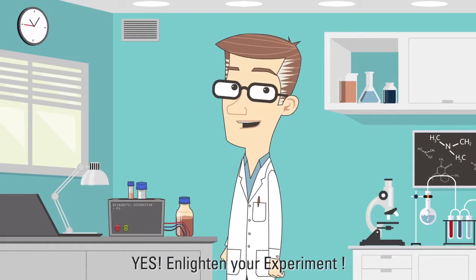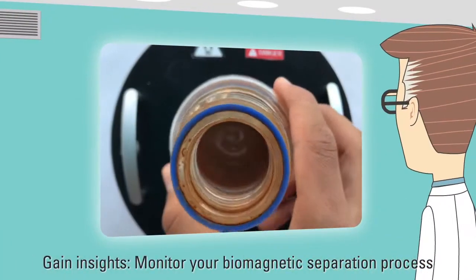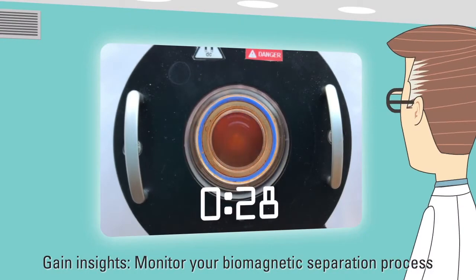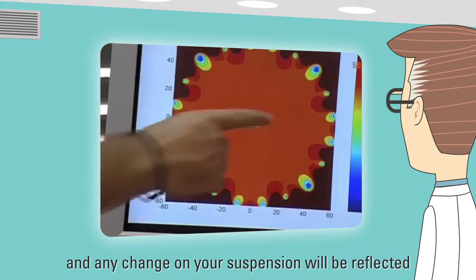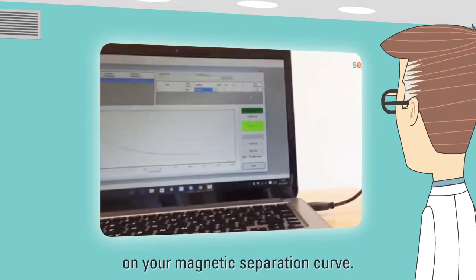Yes. Enlighten your experiment. Gain insights. Monitor your biomagnetic separation process by applying constant magnetic force, and any change in your suspension will be reflected on your magnetic separation curve.